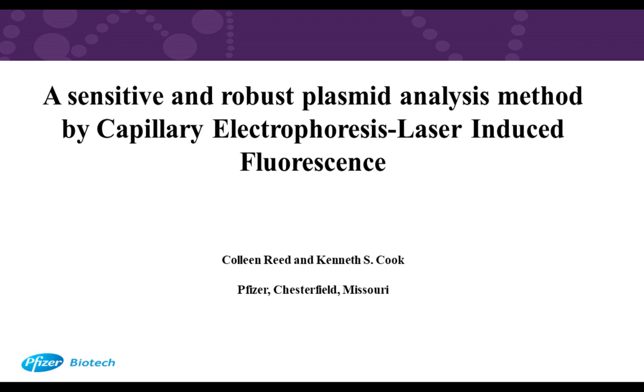Thank you, Colleen. Now, our final question, what would happen if you don't dilute the dsDNA gel? Well, so the undiluted gel basically allows 1,000 base pairs to enter, but larger molecules with 5,000 base pairs will not be able to enter the gel. And so that would affect the plasmids. And so the plasmid size is going to determine this gel dilution, which is required for this separation.